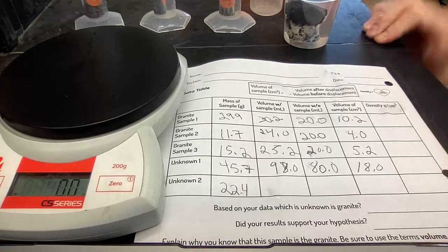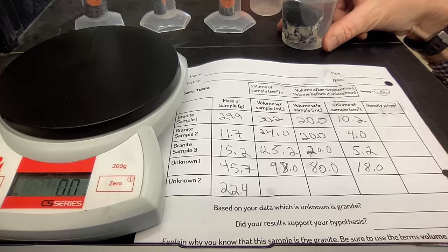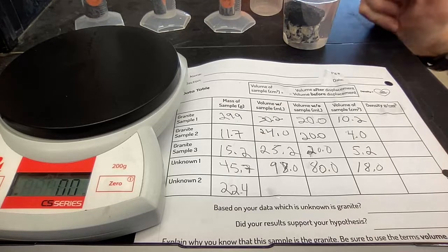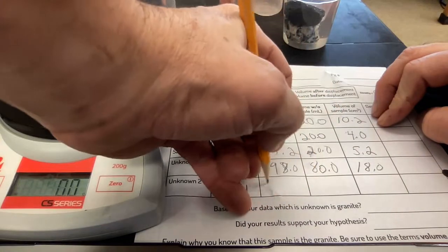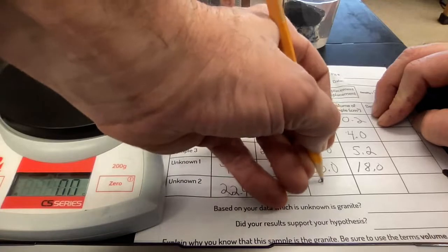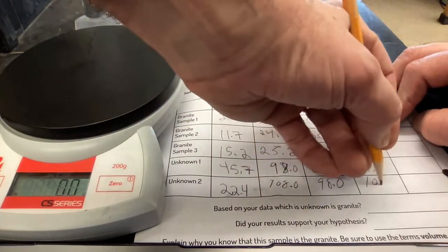I'm going to add this rock to that volume for a new total of, let's see, that's about 108. So it's about 108, but I have to change this to 98 for a difference of 10 milliliters.